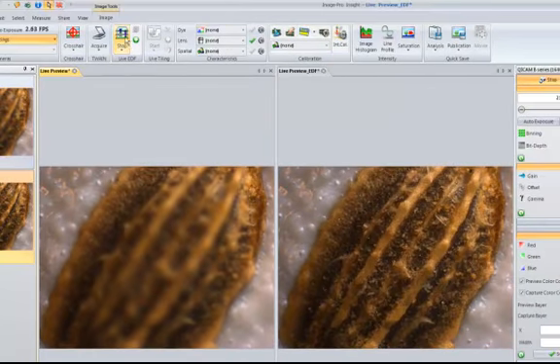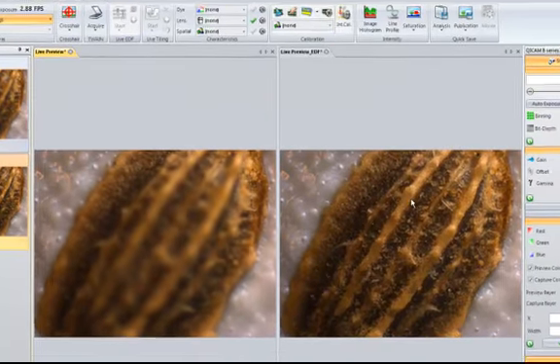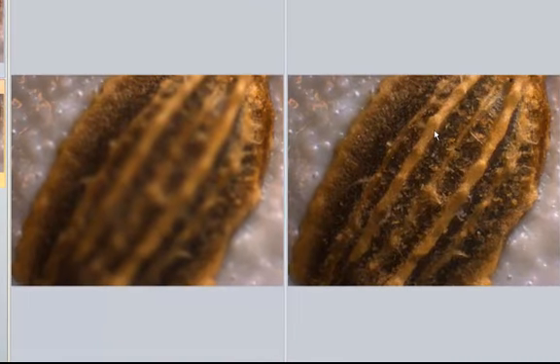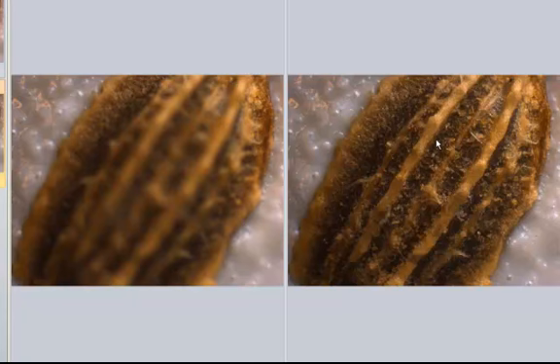I stop the Live EDF, and voila, I have my full extended depth of field image as now an image that can be saved. That is extended depth of field.